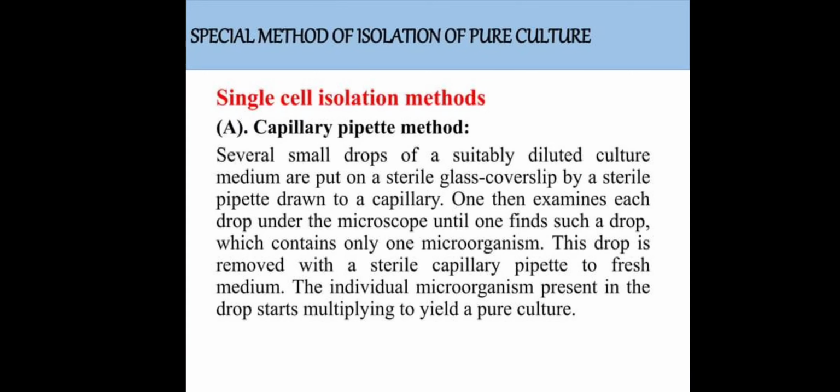In the previous class we discussed the spread method. Today the topic is special methods of isolation of pure cultures: the single cell isolation method, the capillary pipette method.